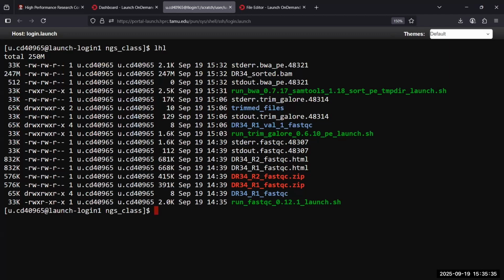Okay, you submit your jobs with sbatch, A tab, RUN, tab, and then B for BWA, tab, enter. And type in Q, and then it's running, it just takes a minute.